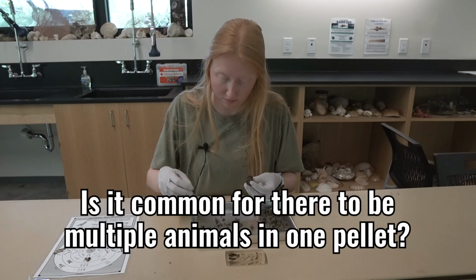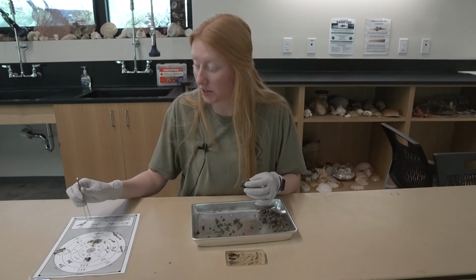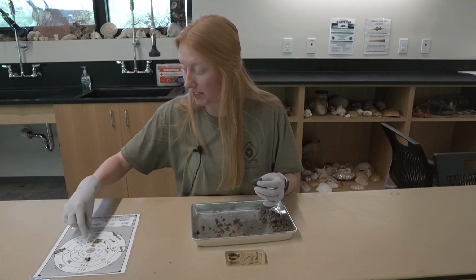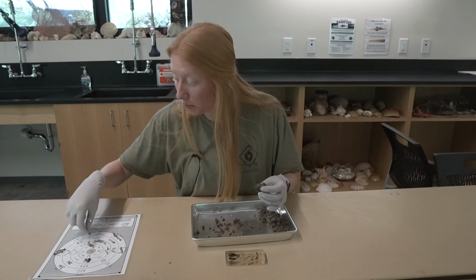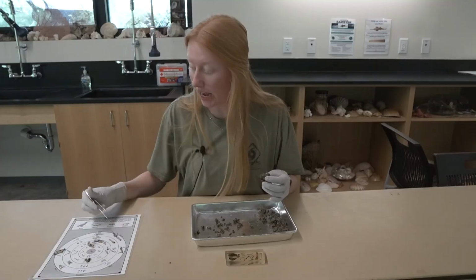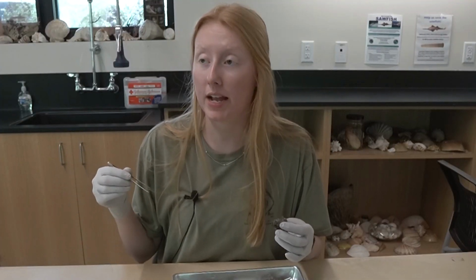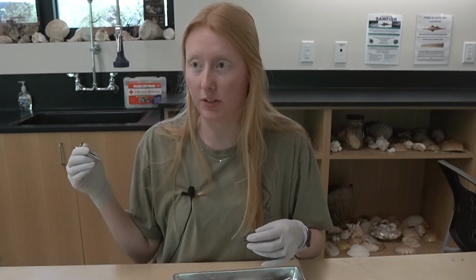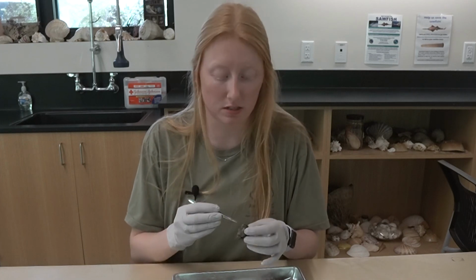Common for there to be multiple animals in an owl pellet? Yes, very common. You can see right here that we found two different sizes of jaws, so more than one rodent was eaten. And since I feel like this belonged to a bird, it's very, very likely that before that gizzard or glandular stomach gets filled up, they can eat multiple things.